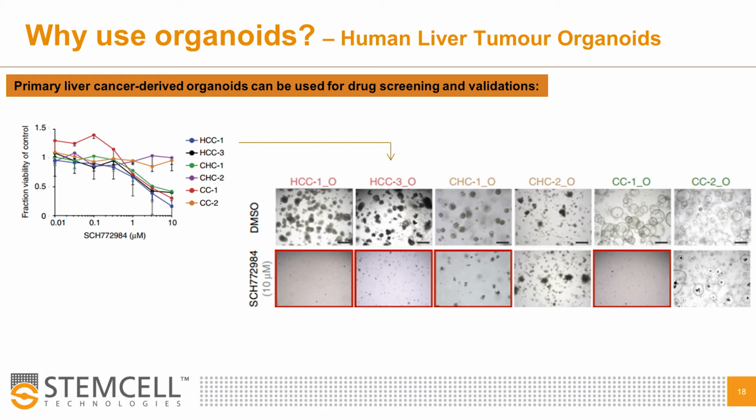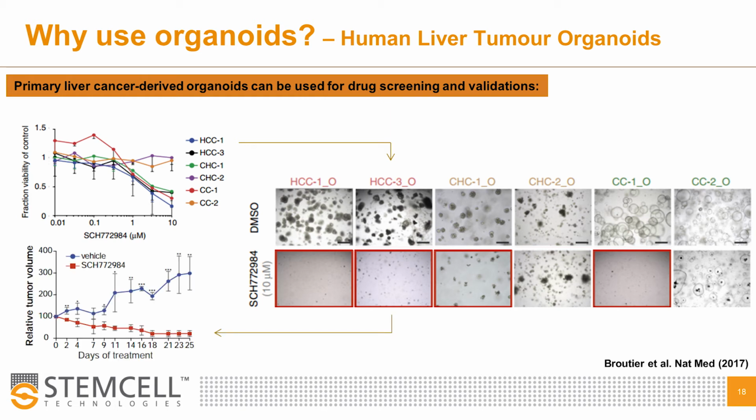To test the efficacy of this compound at inhibiting tumor growth in vivo, tumoroids were transplanted into immunodeficient mice, and when tumors had reached 100 cubic millimeters in size, the ERK inhibitor or a negative control were injected into the tumor. 2 to 7 days after the first injection, the authors observed significant reduction in tumor growth, which lasted for the remainder of the experiment. Histological analysis revealed that the tumor mass was necrotic and that the majority of the cells were apoptotic.